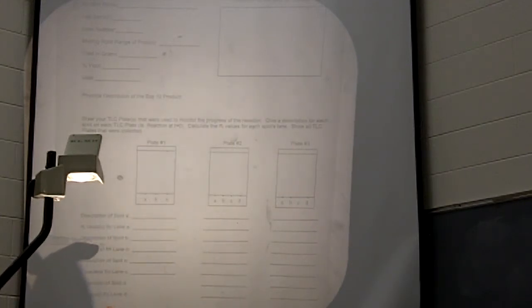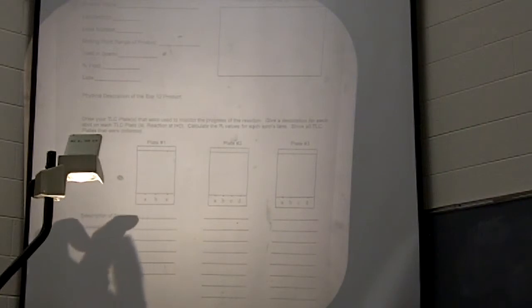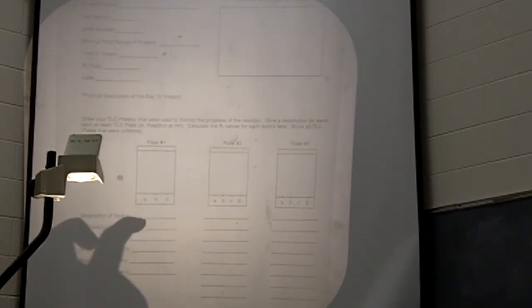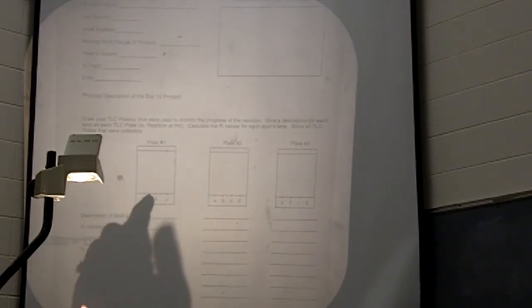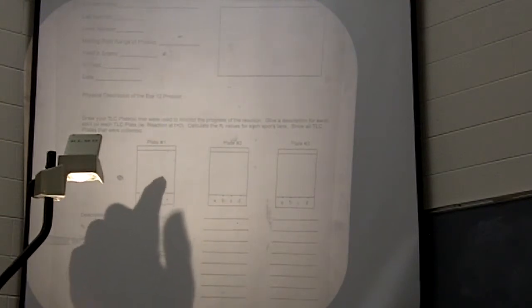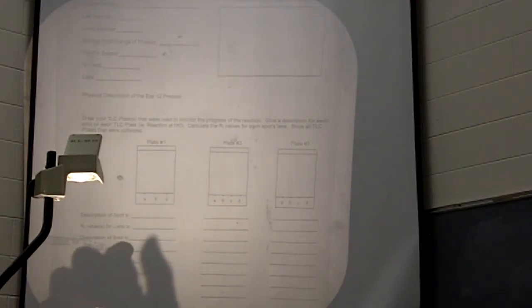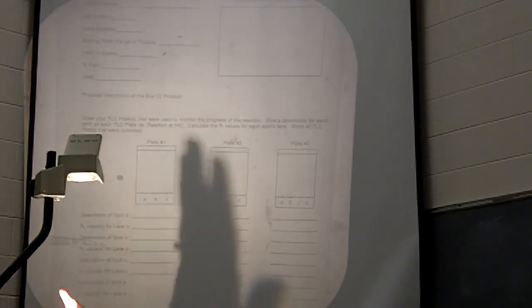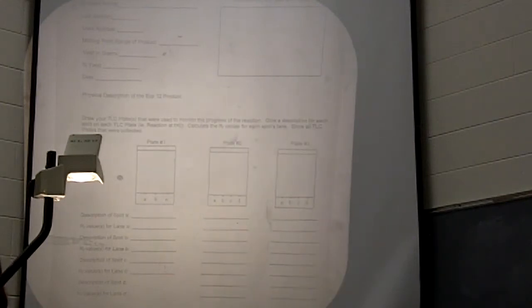Then you need to give the Rf value or values for that lane. If you have one spot, you have one Rf value. If you have two spots, then you need to give two Rf values for that lane. Okay, is everybody clear on that? You will show all the TLC plates that you developed. You probably won't have more than 3 TLC plates.